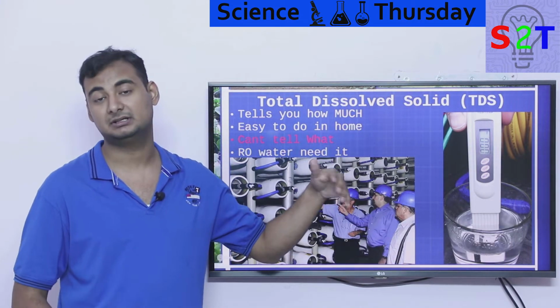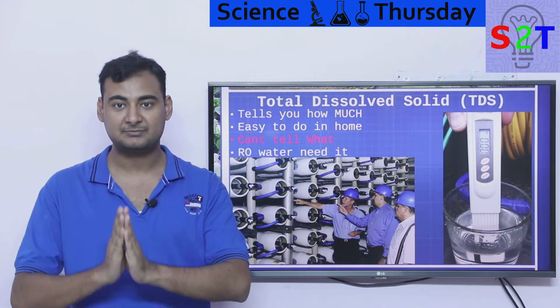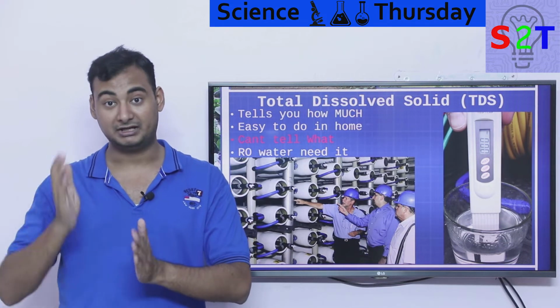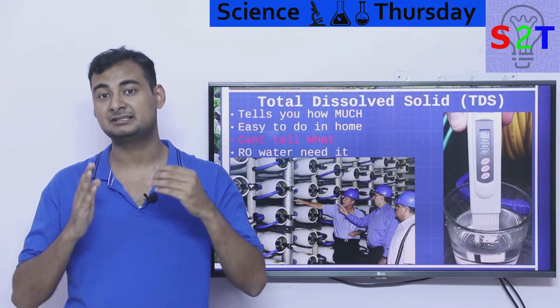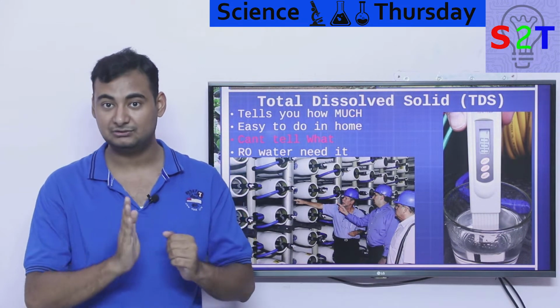It is used in all sorts of medical purposes and in water treatment plants, where you'll be like, okay, no matter what happens, drinking water should not exceed 500. Now again, I specify this again and again, 500 of what? There is no indication of that. So people are like, even at 500, let's say something poisonous or contamination is there, it won't be lethal to you. So generally drinking water is tried to be kept at below 300.